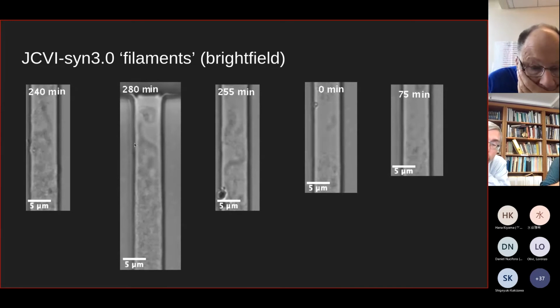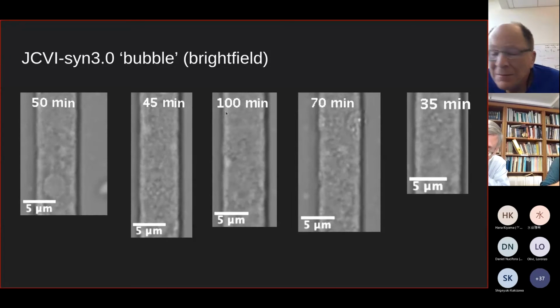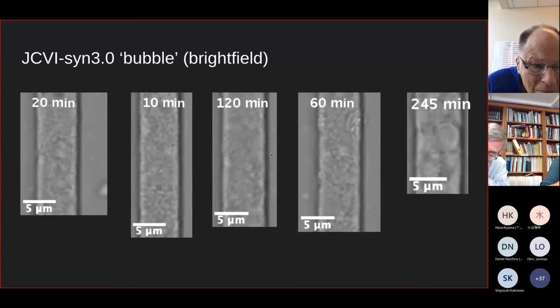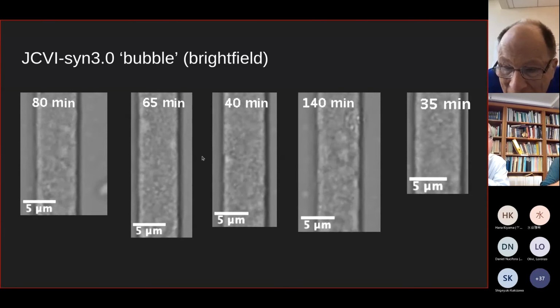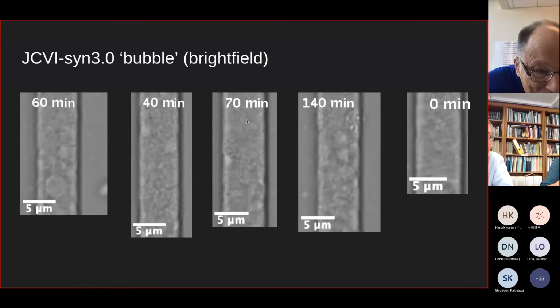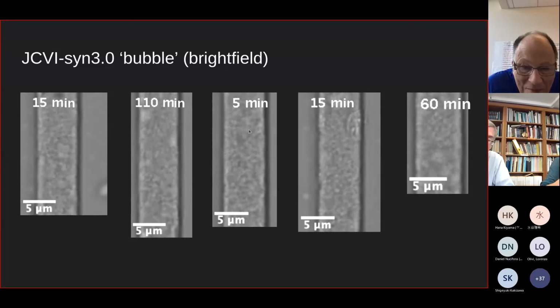Then we also have some footage of bubble formation in this Syn 3.0. We're not really sure what the bubbles are yet. I'm actually extremely interested to hear what people have to say. Essentially, as they grow, you can see these spontaneous bubbles arise among all of the mycoplasmas. So you can see it right there.